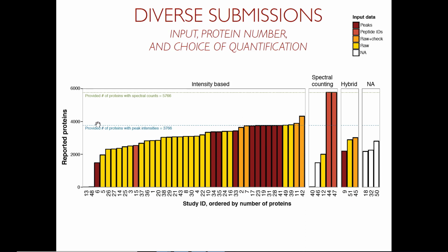You see that this horizontal line is the number of proteins which we provided as part of our analysis. The first thing you see here is that the number of proteins reported by different studies was quite different. By the way, those guys misunderstood the instructions. They only reported differentially abundant proteins. Talking about reproducibility right there, even understanding the instructions is not obvious. But there's quite a bit of variation even in the number of proteins which the participants reported. But that was not our objective.